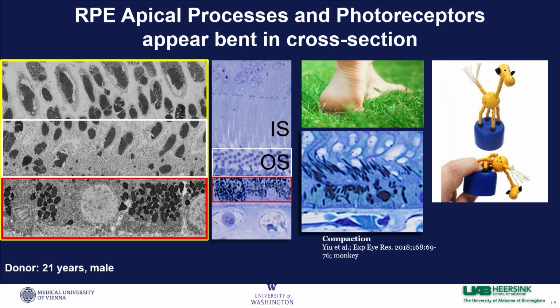So that's something we wanted to model and maybe create a mesh with, but our computer said no, and it just wouldn't work on our current hardware. So we're still thinking about somehow straightening those out.